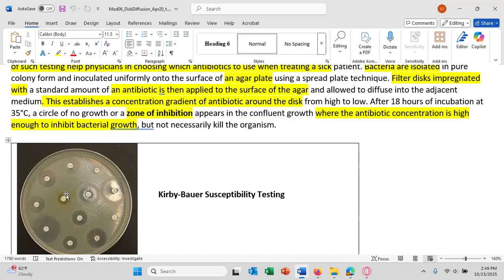So it isn't as good at testing a disinfectant as it is for testing an antibiotic. Any questions about any of that? And the main reason is simply because an antibiotic has to diffuse through a patient's blood, through the tissues, to get the organism it's trying to kill or inhibit. And a disinfectant does not diffuse. You apply it to the surface you're trying to disinfect.